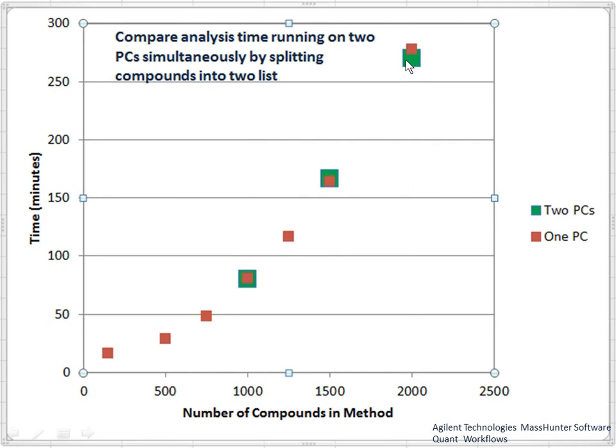Now, this graph is nonlinear. So if I were to organize it so that I could analyze that in 1,000 and 1,000 at the same time, two batches finishing, you'd see that I'd finish in roughly 80 minutes. So that's a difference of well over 3x in terms of the finishing time, organizing with this dual computer configuration.